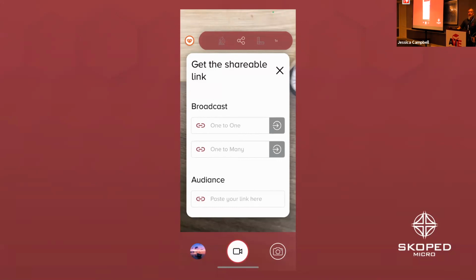So there was another question somewhere. Yes. No. It's on right now. Has anybody seen the micrometer? Any other questions while we're waiting on Kier?